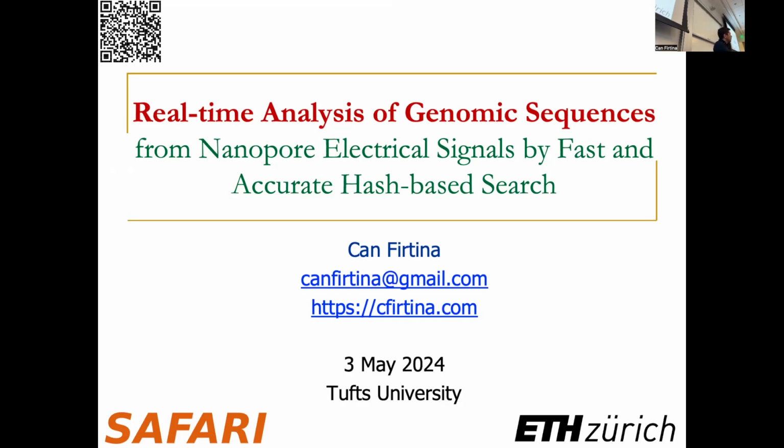Okay, so that's not the problem they're solving. They're doing nearby. But then you can quantize the same as you're doing for the exact hash, right? If I was able to give you a range, and whenever the k-mer was close enough in Hamming distance, I was also not too far from that range, you could also have a quantized signal where you could do what you're doing. Yeah. We also use the nearby k-mers, but maybe for different purposes in BLEND. So it's using the SimHash technique, and a new minimizer technology. Exactly.